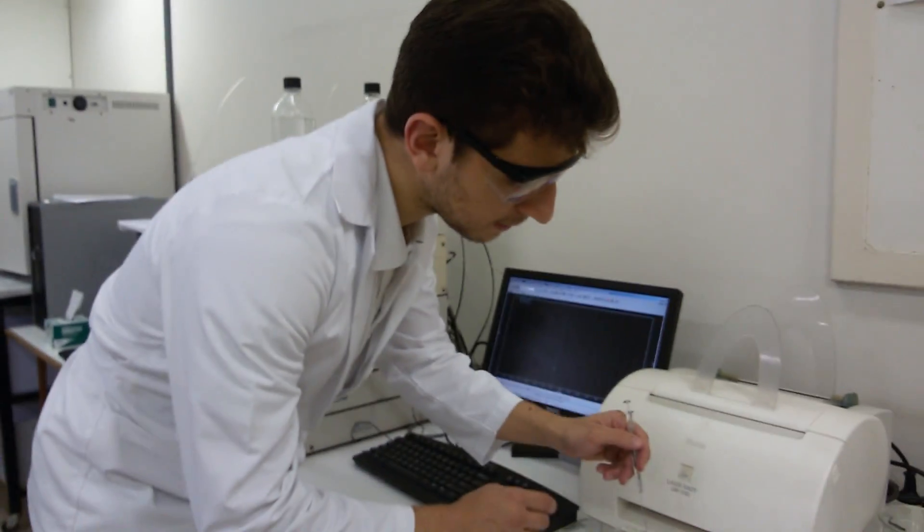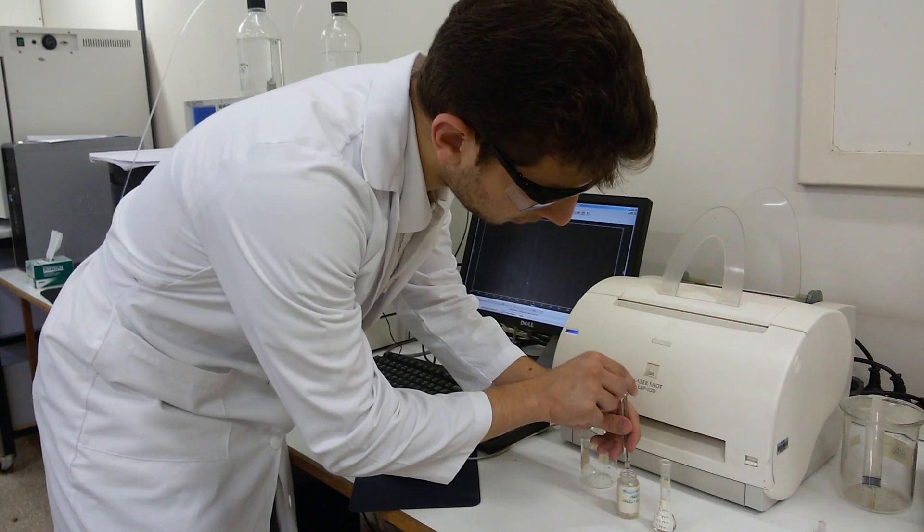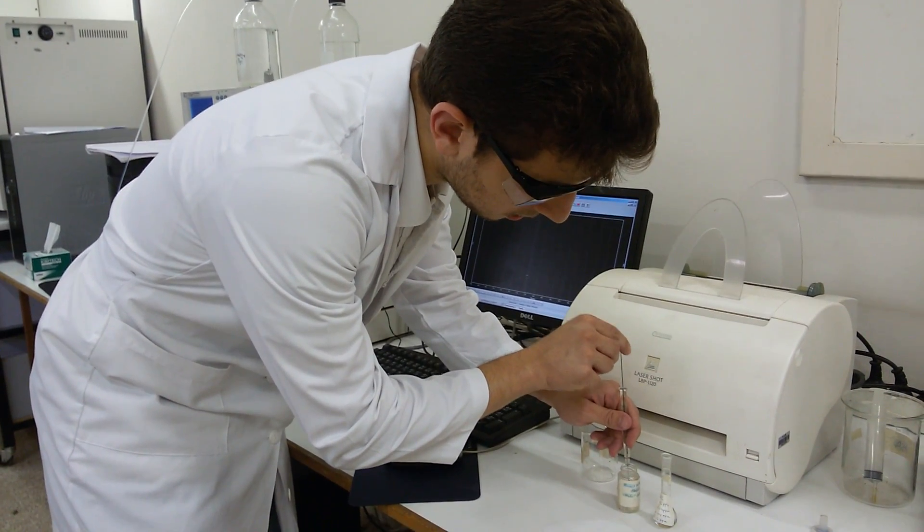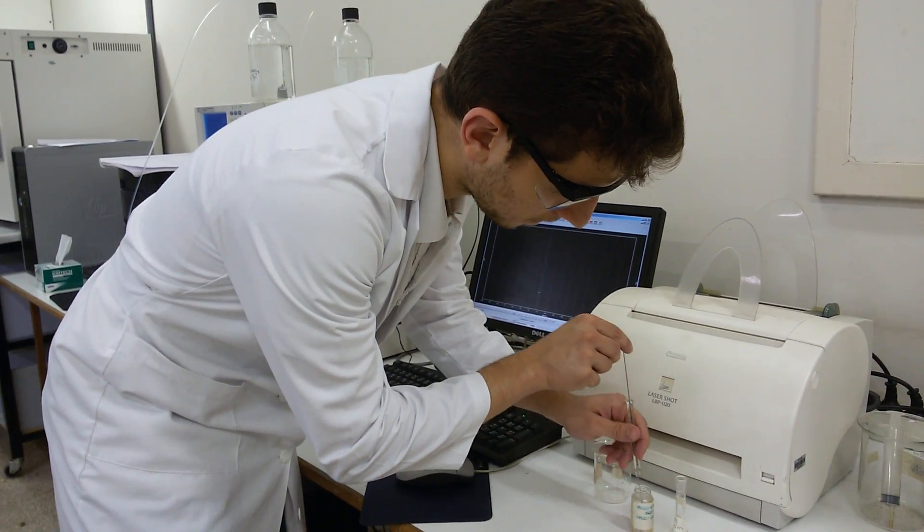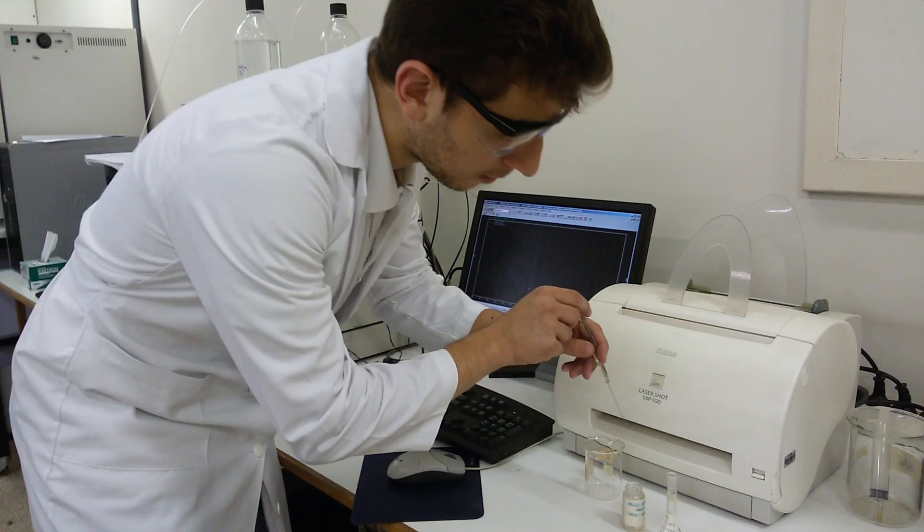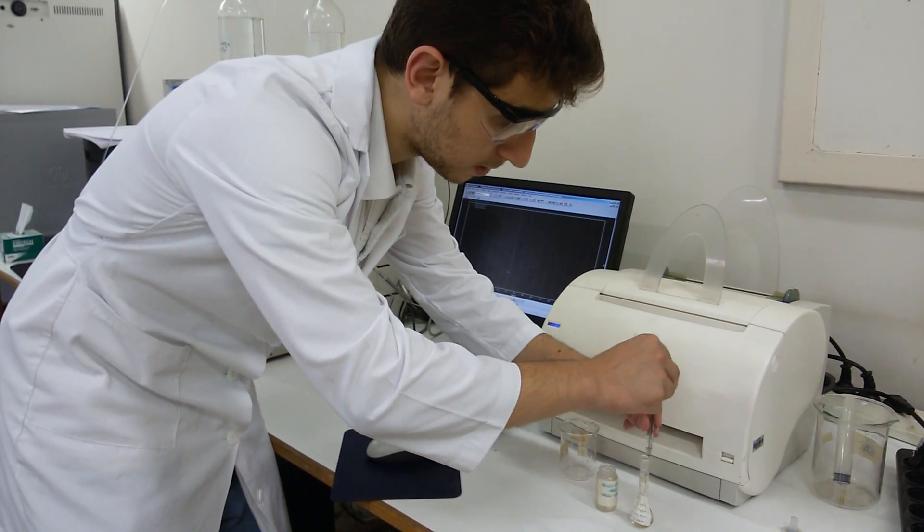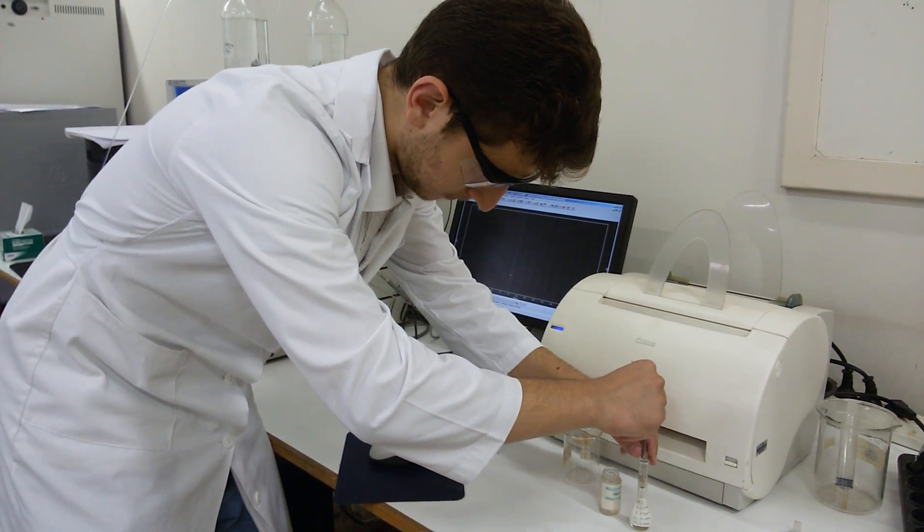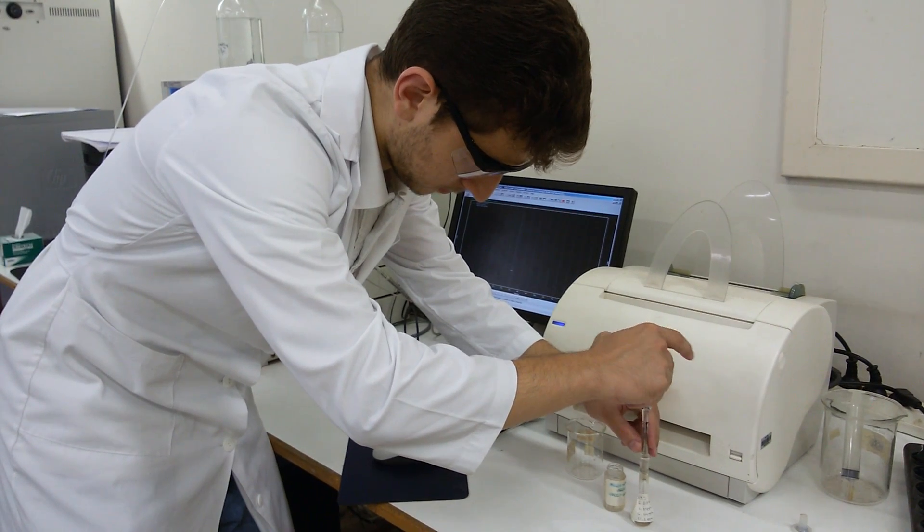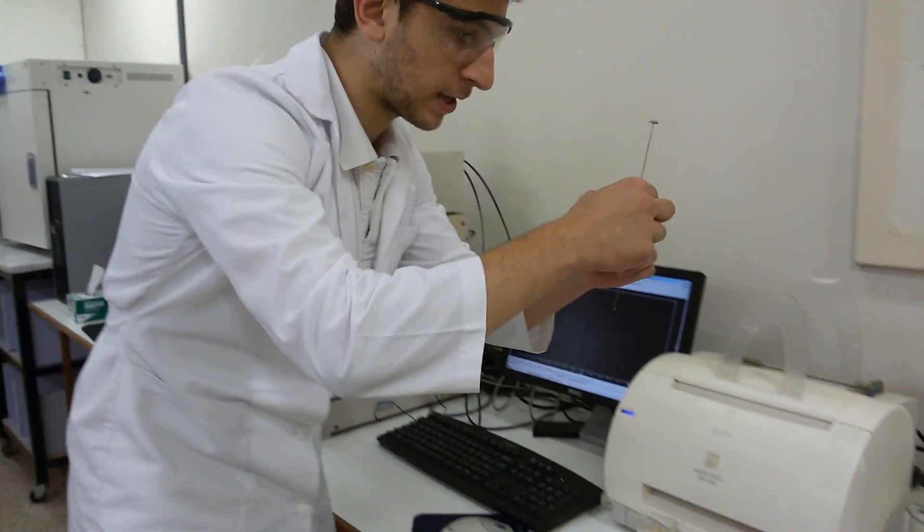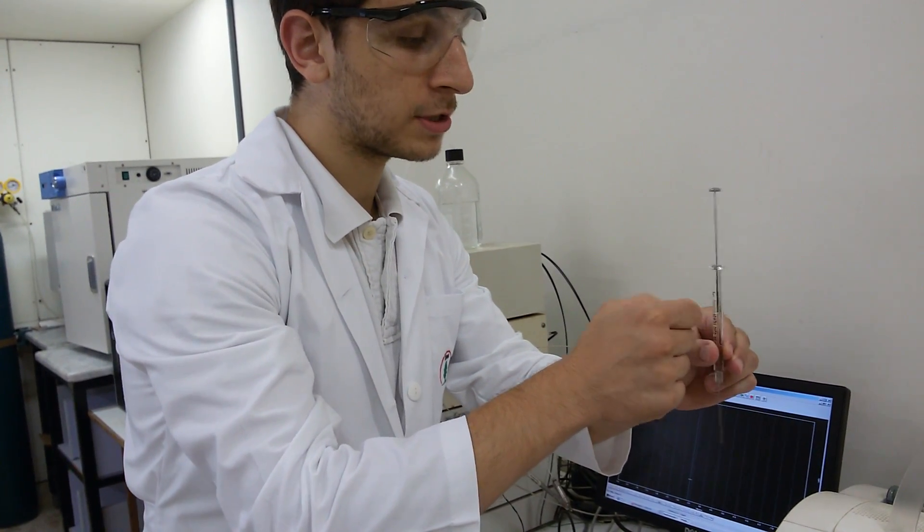First before doing the injection I need to rinse my syringe properly with methanol. Then I need to fill my syringe up to 40 microliters. Okay that's 40 microliters, I want to make sure that there is no bubbles at all inside my syringe.